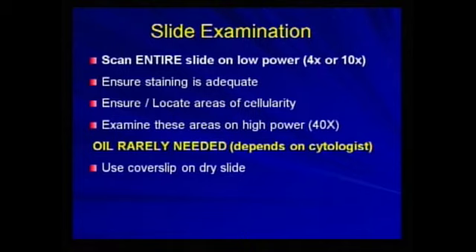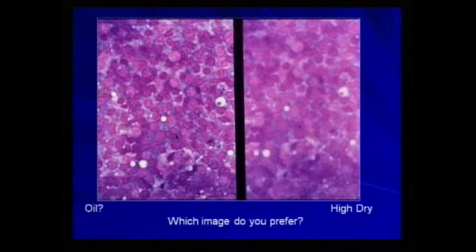And of course, we're going to look at this, but cover slip your cytologies. Generally, practitioners don't. A lot of times when we get them, the slides are just covered with oil. There's no cover slip. But you will be amazed, I'll show you in a moment, what cover slipping your slide will do. Obviously, you want to wait until the stain is dry.